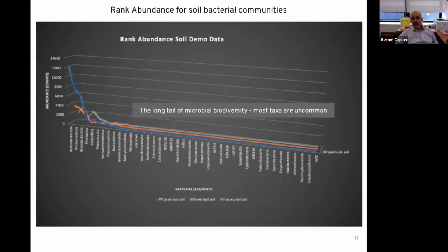Well, maybe I could answer that, because the first question is, is it reproducible? The second is, if you're controlling for all the equipment and the tubes you're using with a no sample control, it shouldn't come up. But I'd say if it's on the far right of the curve and it's reproducibly found but isn't in your no sample control, then that's probably a result. Yeah, that's exactly it, even if it's really low abundance.